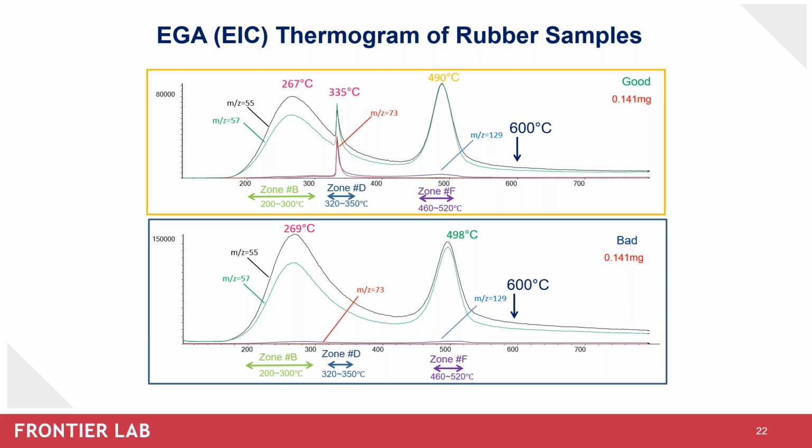But if it were for double shot, you would not drop the cup out of the eco stick that is attached to the manual injector. So therefore, just simply take out the manual injector and you will not need to worry about retrieving the sample cup.